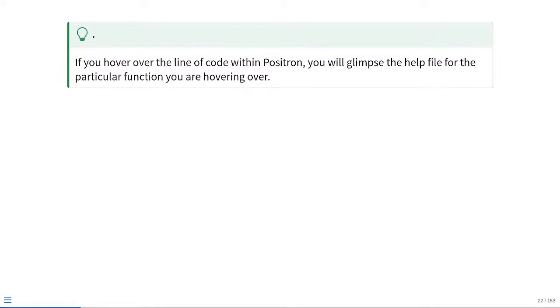A similar situation happens if you are somebody who does a little bit more coding already and have used Visual Studio Code. Positron is a forked version of Visual Studio Code with a bunch of the RStudio components added on top. You can probably mimic what you see in Positron if you're already somebody who extensively customizes what you use, but it's a little bit harder to do than just installing it off the bat. So I hope this provides a little bit of context as to why we're using Positron. Obviously, if you're a company and you're not able to install Positron, we'll figure out a workaround for you guys in that case.